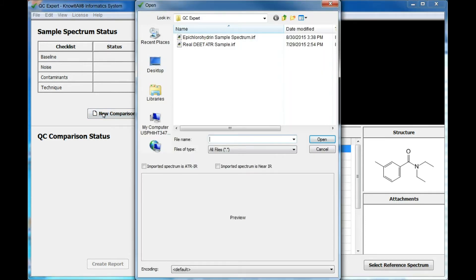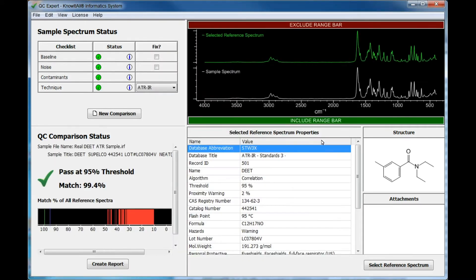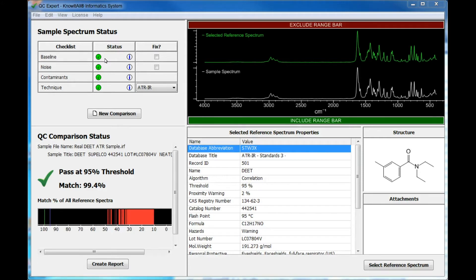Navigate to and select the spectrum you wish to compare. QC Expert automatically performs the quality check and displays the result. The green checks in the sample spectrum status area indicate there are no baseline or other issues with the sample spectrum. If your sample spectrum has issues, click the Fix check box and QC Expert will correct them. Click any information icon for details.